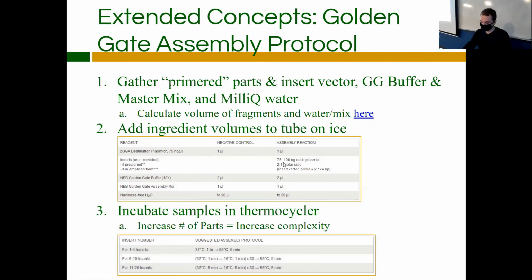As you can see, it's, of course, like all these procedures, dependent on your concentration of DNA. So you only want so many nanograms of each fragment within your solution. Typically, you're going to want these as equal molar fragment ratios, so one part doesn't outcompete the others and make the process messy. Of course, these are stable. And then for the nuclease-free H2O, the volume of that just changes depending on what your concentration of DNA is.